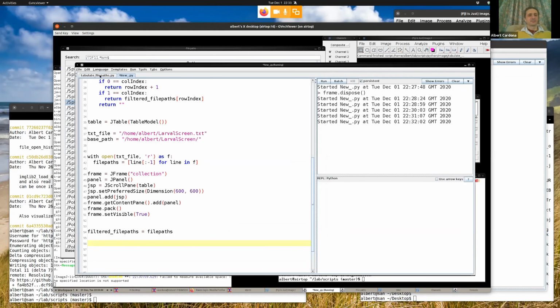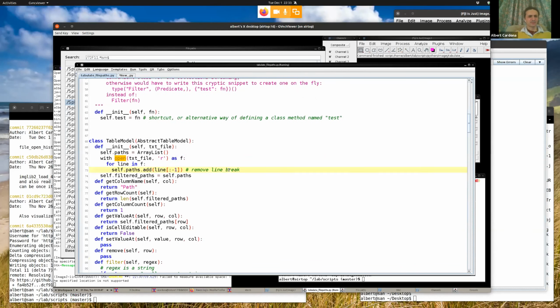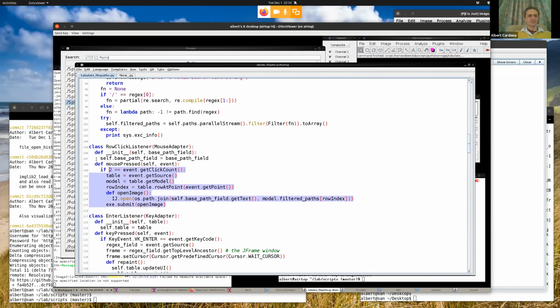I've forgotten. So I'm just going to go and look at a bunch of examples. And I'm pretty sure this is the row click listener. Yeah, it is. I'm just going to copy it whole.